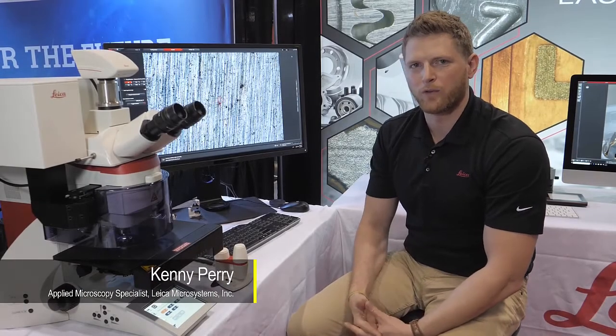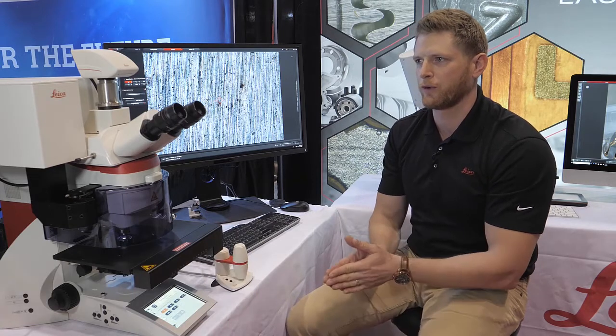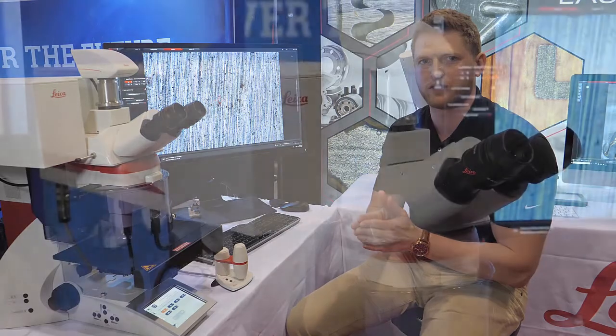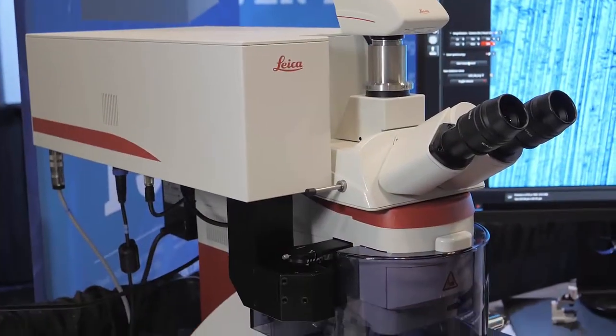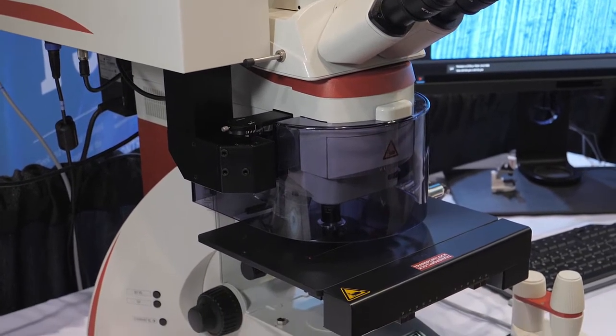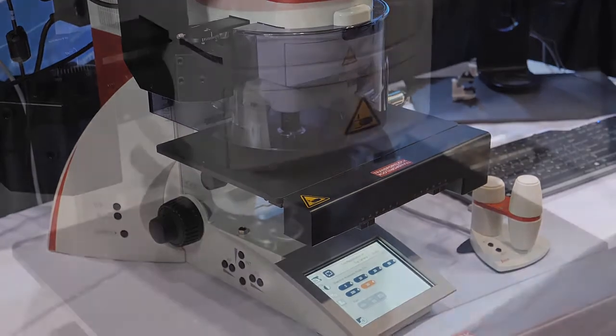Hi guys, I'm Kenny Perry. I work for Leica Microsystems. What I'd like to do is briefly run through a quick 10,000 foot view of our new LIBS device, which is a laser induced breakdown spectroscopy tool. It's a laser attachment that simply attaches to our DM6 fully automated optical microscope.